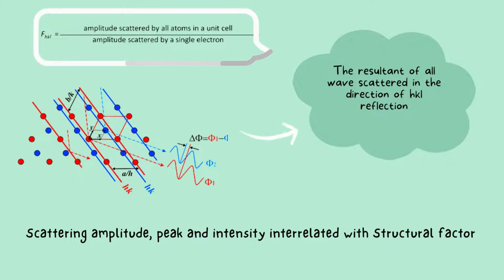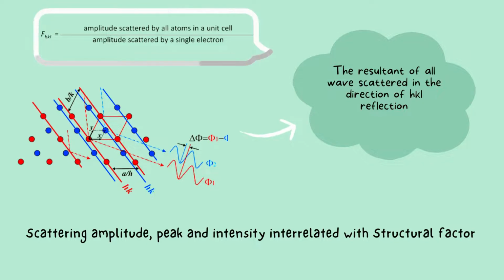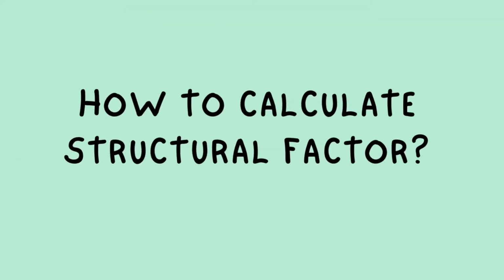The structure factors, F(H,K,L), are the fundamental quantities on which the function of electron density depends. The structure factors calculated with formula from the known atomic structure are represented by vectors which consist of modules and phases. How to calculate structural factor?